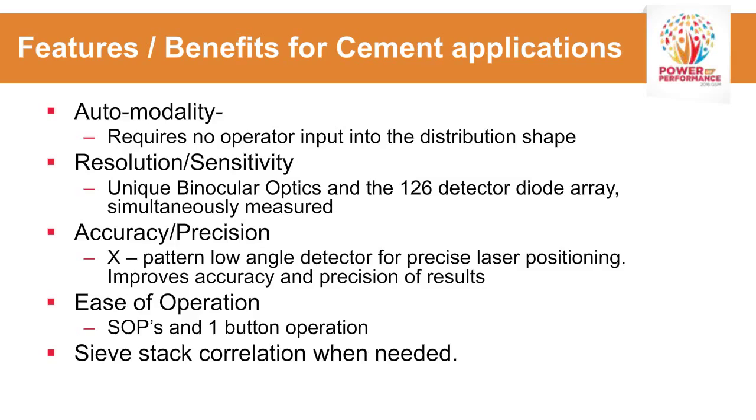Because usually laser diffraction instruments measure more of the volume of the particle, so when you're sieving, you're measuring the middle dimension of a particle. So you can correlate back to this size. You can apply a correlation factor in the instrument's output to correlate directly to screens that you use.